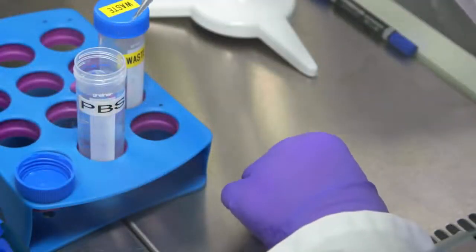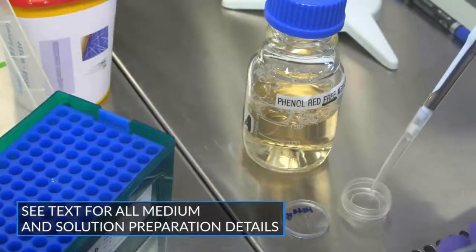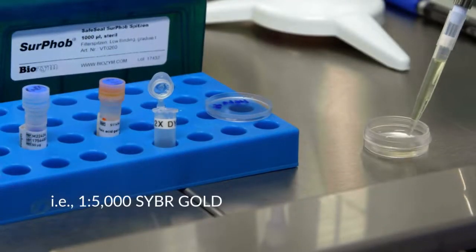The next morning, wash the cells in 2 milliliters of PBS before adding 1 milliliter of phenol red-free culture medium and 1 milliliter of the appropriate 2X labeling solution.